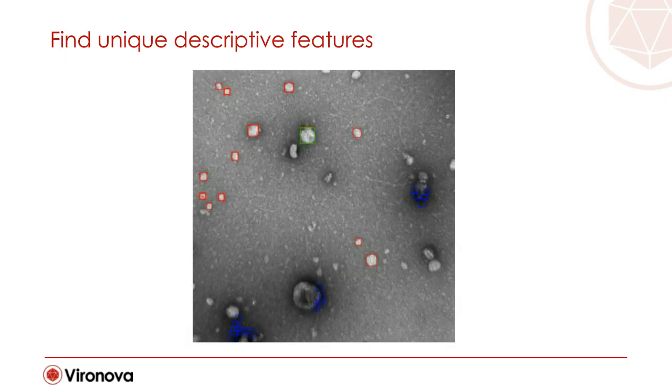When we pinpoint localizations of details or contexts surrounding each particle which represent a specific and biologically relevant structure, these feature proposals can then undergo a robustness and generality assessment before being deployed. That is to check that the details are specific for a certain particle type and that we have separability of these unique features above the noise level.